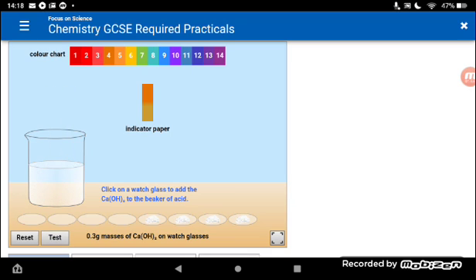It's a very frustrating practical to do in the lab, because it doesn't actually happen this quickly. It takes 5 or 6 of these to actually even change it from a dark red colour. The reason is, and you'll see why in a second, it has something called a titration curve. So there you've got about pH 10. Keep going. Keep adding it in and keep testing, and it will stay up there at roughly about pH 12.